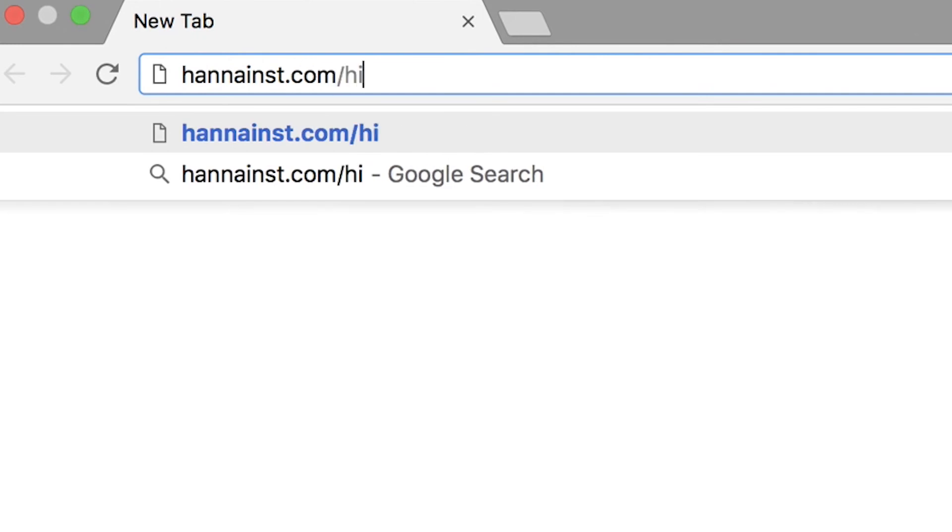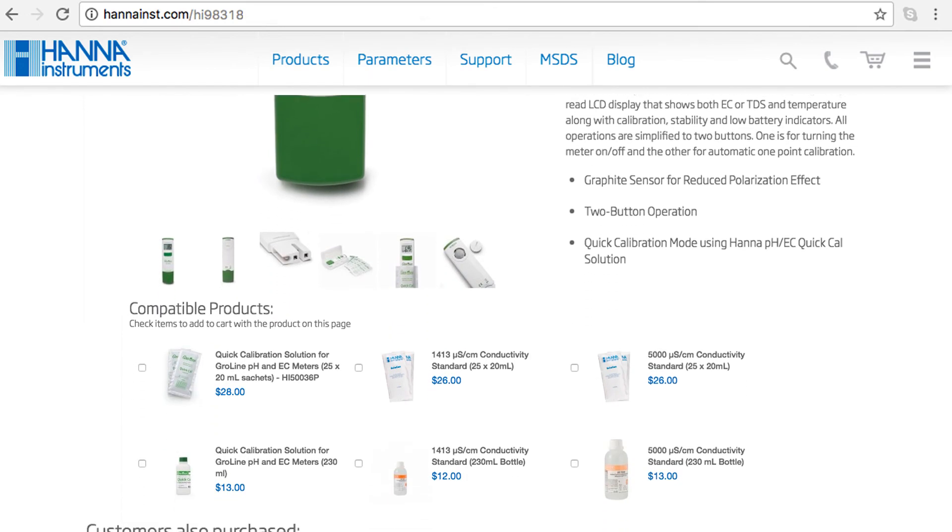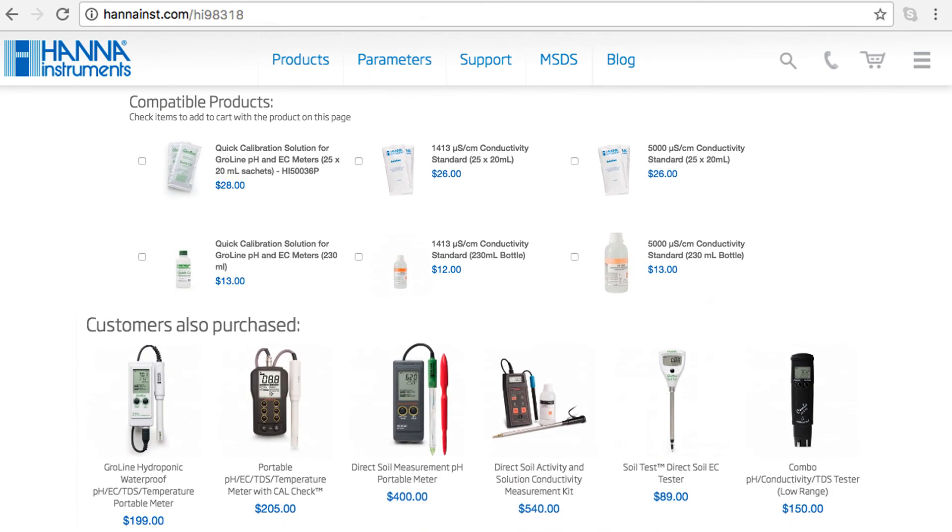Remember to always rinse your tester before and after calibration and sample measurement. You can find everything you need for your tester at hannainst.com/HI98318. Solutions and other products can be found right on the product page.